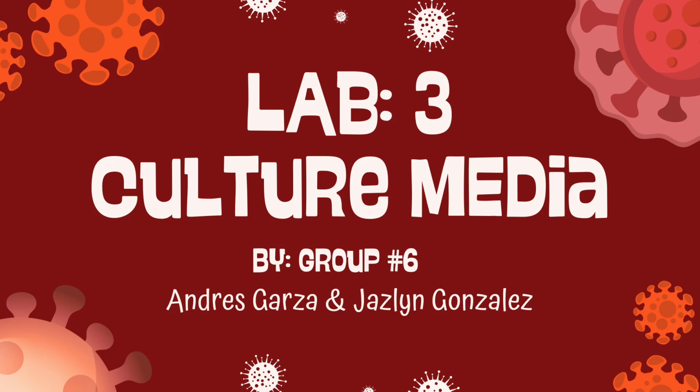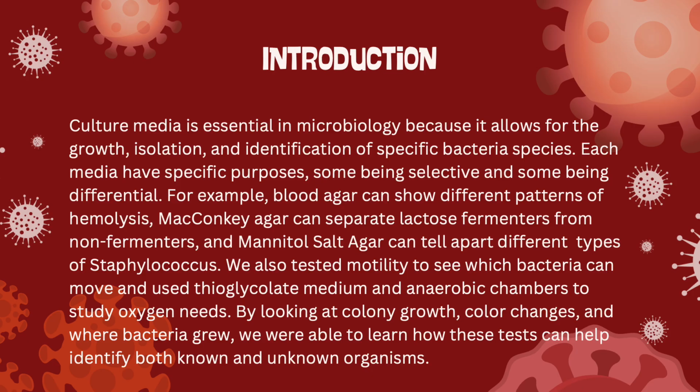I am part of group number 6 with Andres Garza, and today we will be presenting over Lab 3, Culture Media. Culture media is essential in microbiology because it allows for the growth, isolation, and identification of specific bacteria species. Each media has specific purposes, some being selective and some being differential.